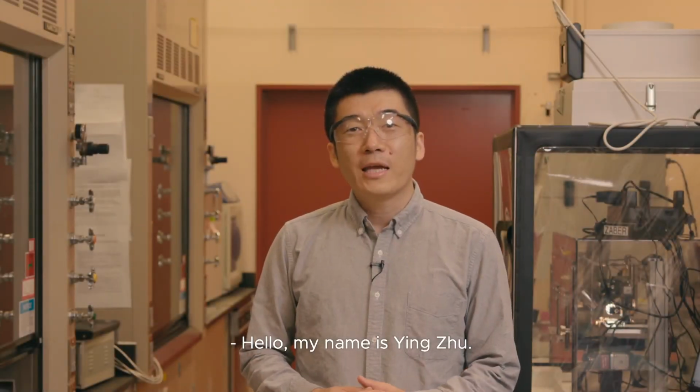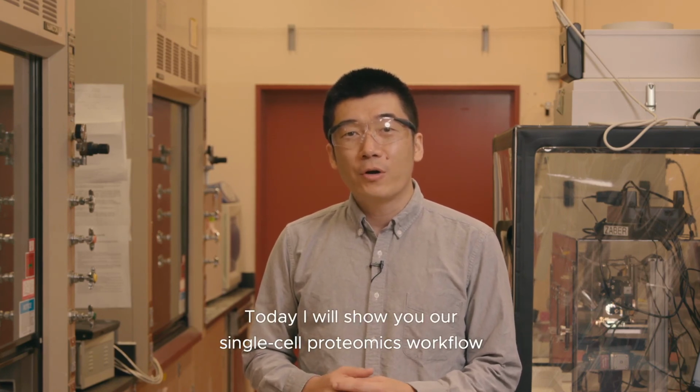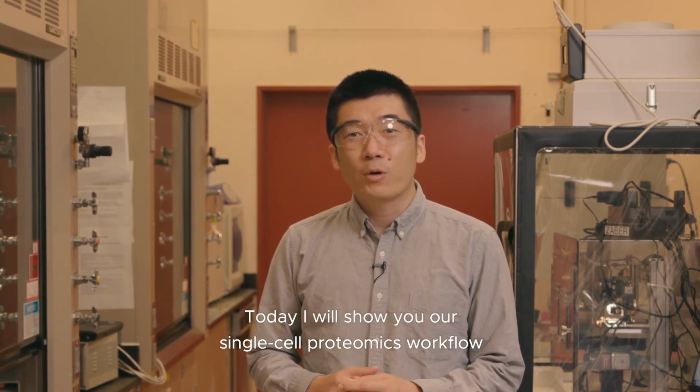Hello, my name is Ying Zhu. I'm a research scientist at EMSL. Today, I will show you our single-cell proteomics workflow using nanoPOTS technology.